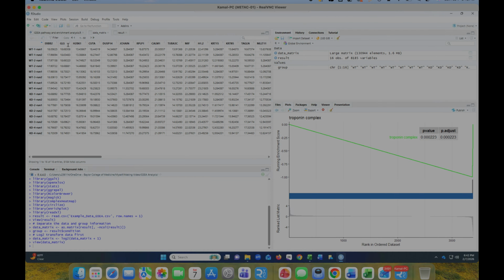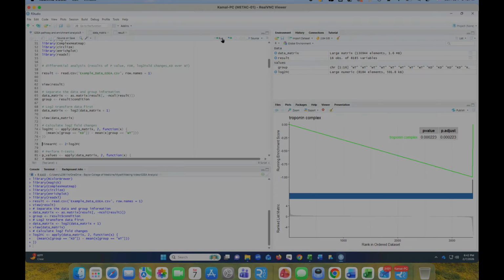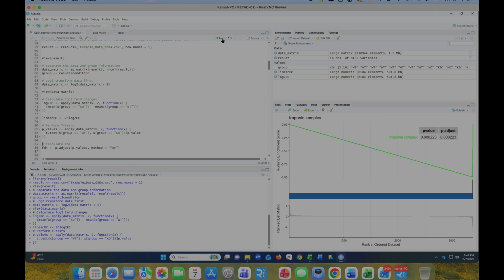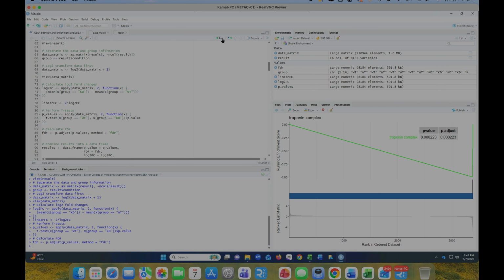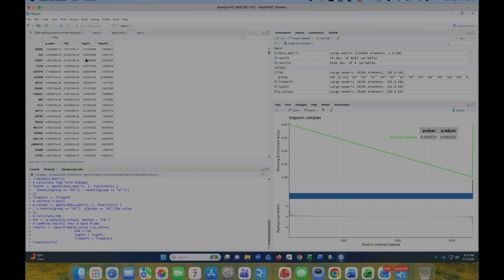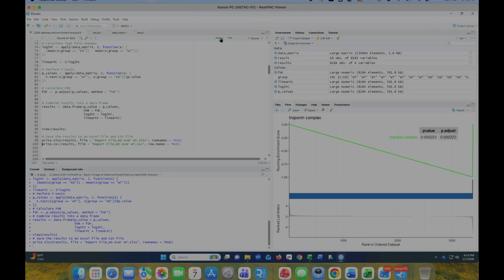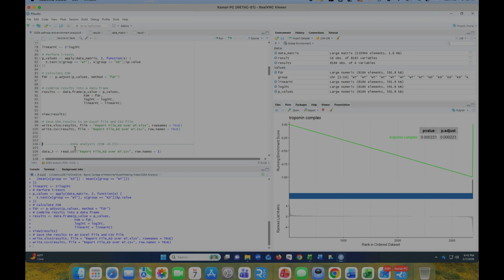First we need to do the log2 transformation, since this is the raw data. Then we calculate the log2 fold change and the linear fold change. Then we perform the p-value calculation with a t-test, and the FDR calculation. Finally, we save the data in Excel and CSV. And then we perform the GSEA analysis, using the report file we got from this differential analysis.